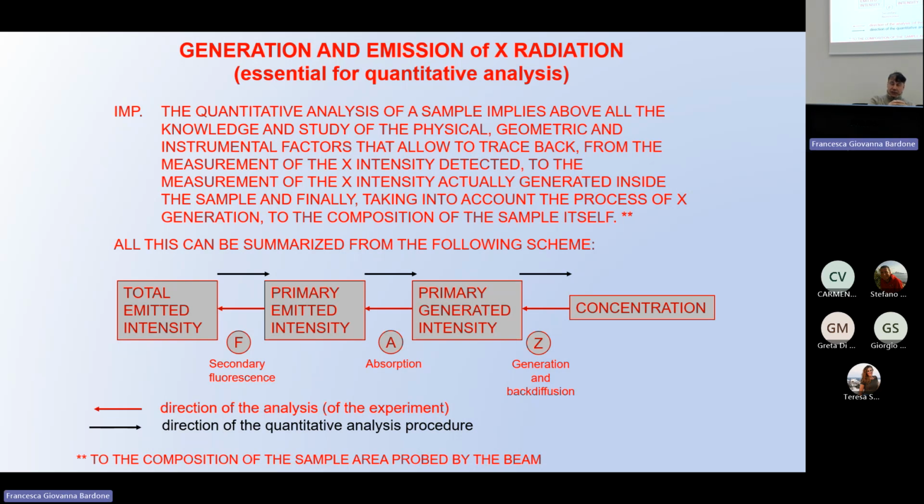These X-rays are escaping from inside to outside. But moving from inside to outside, they can escape easily or can interact with the matter around. Remember, they are produced inside and they need to escape. During their path to escape, they find material and can ionize it, which is ionization due to X-rays.